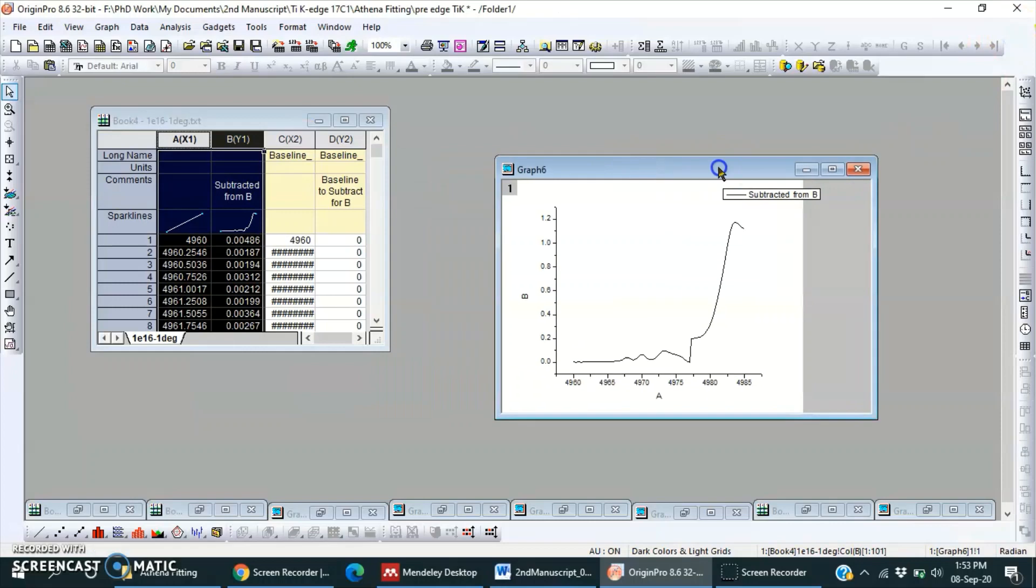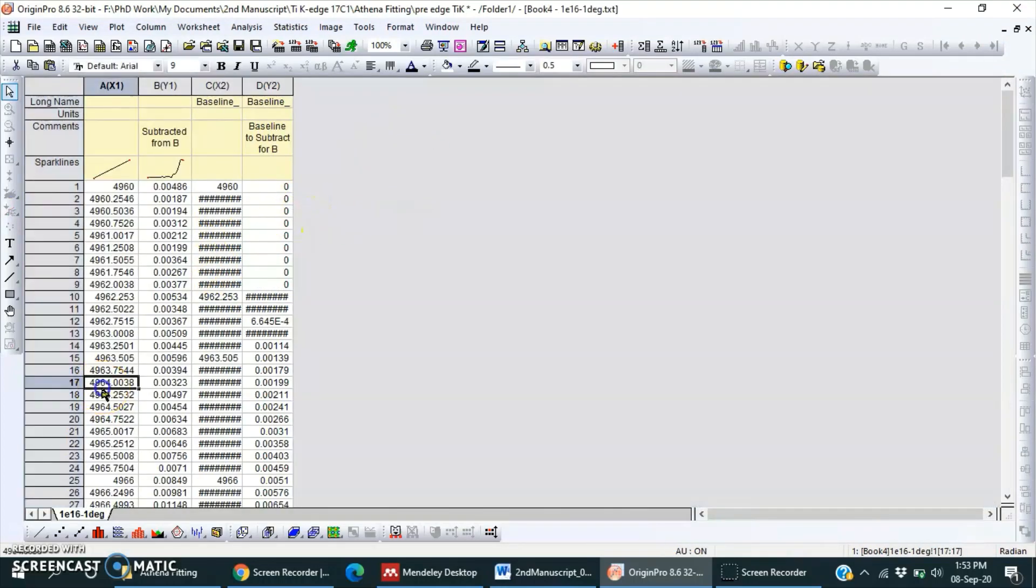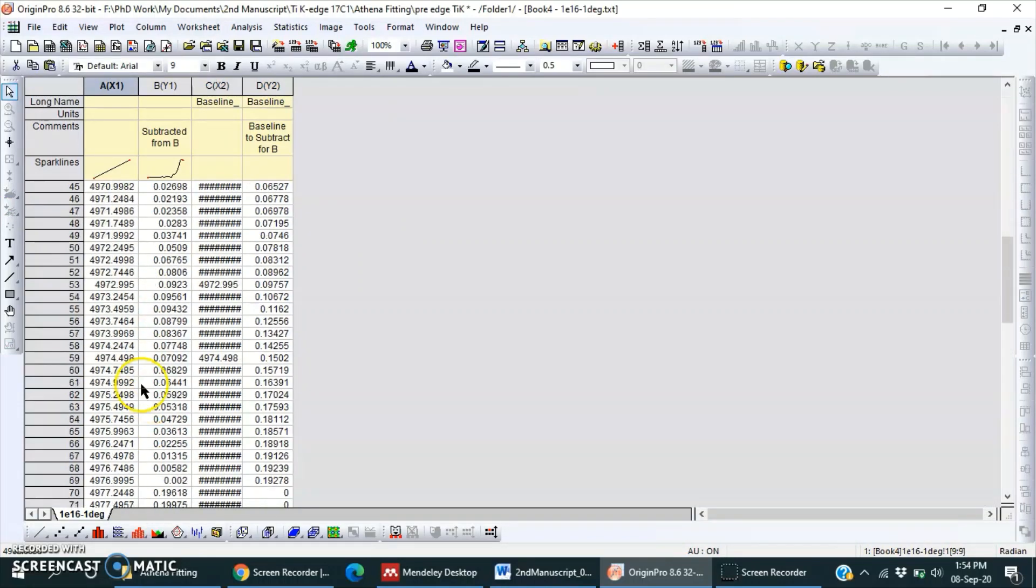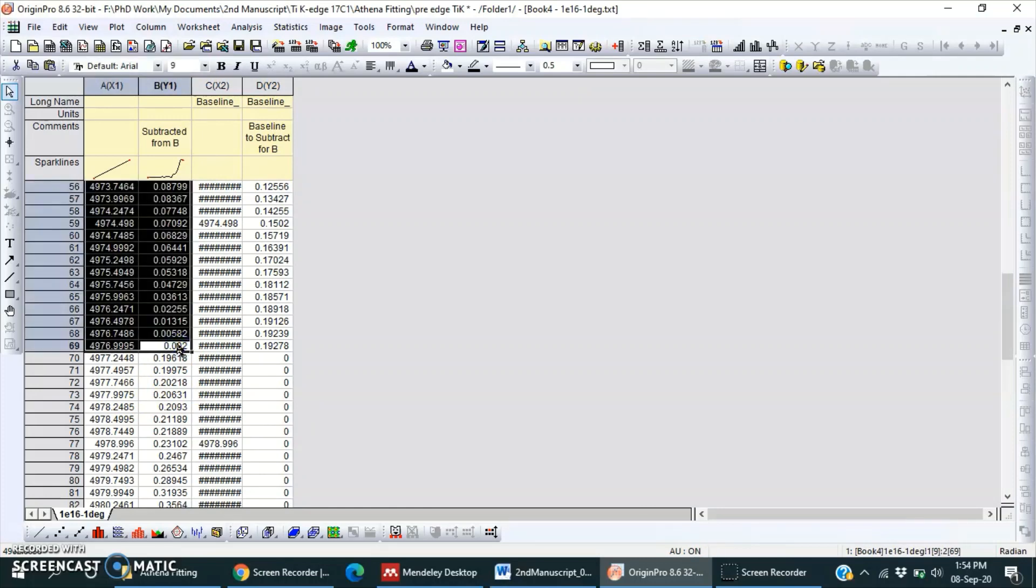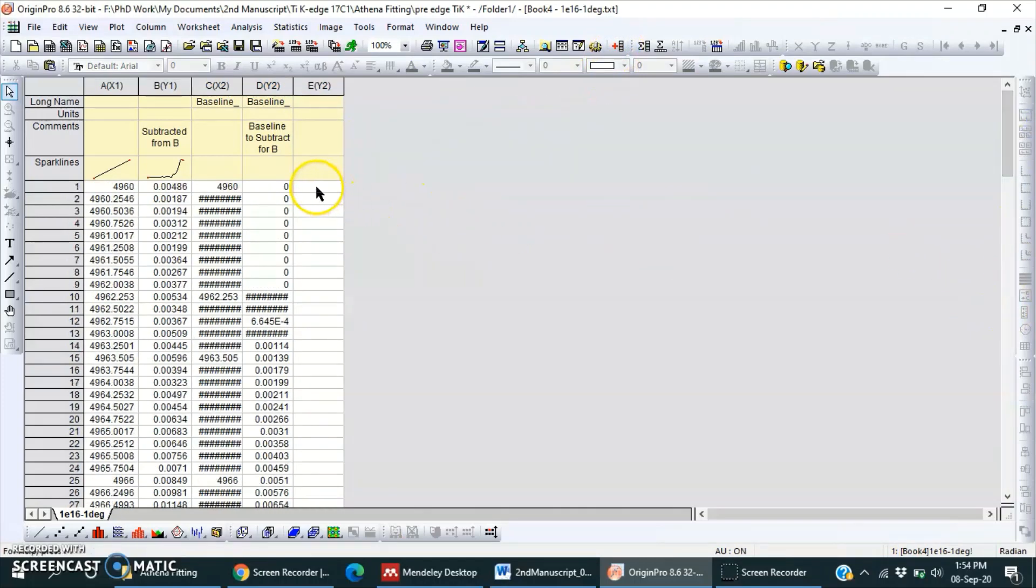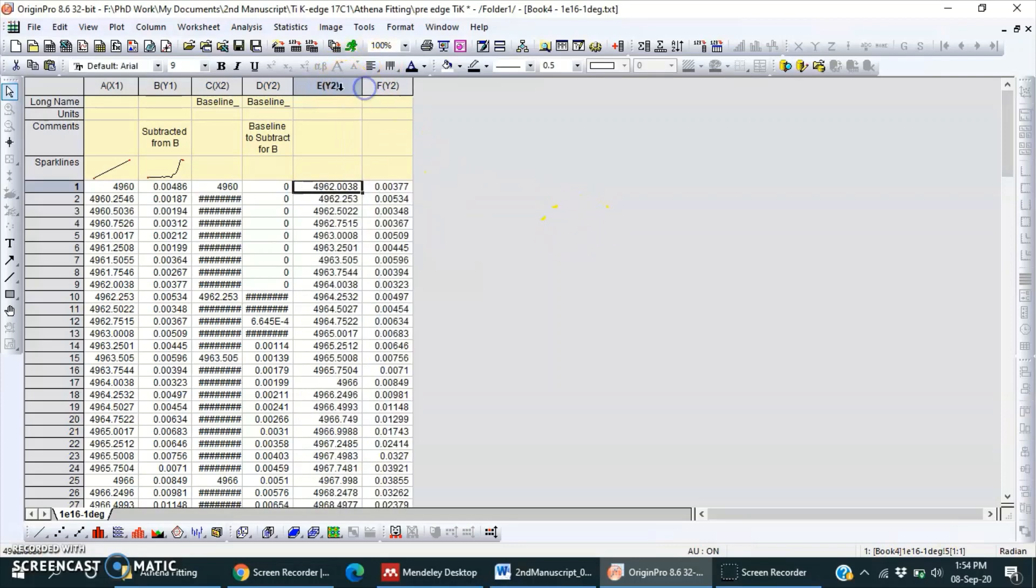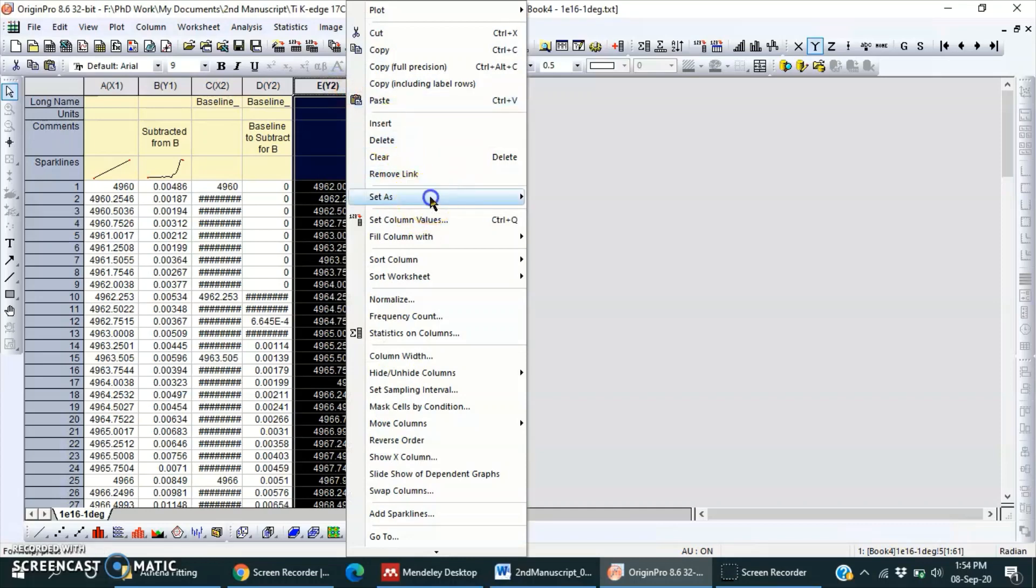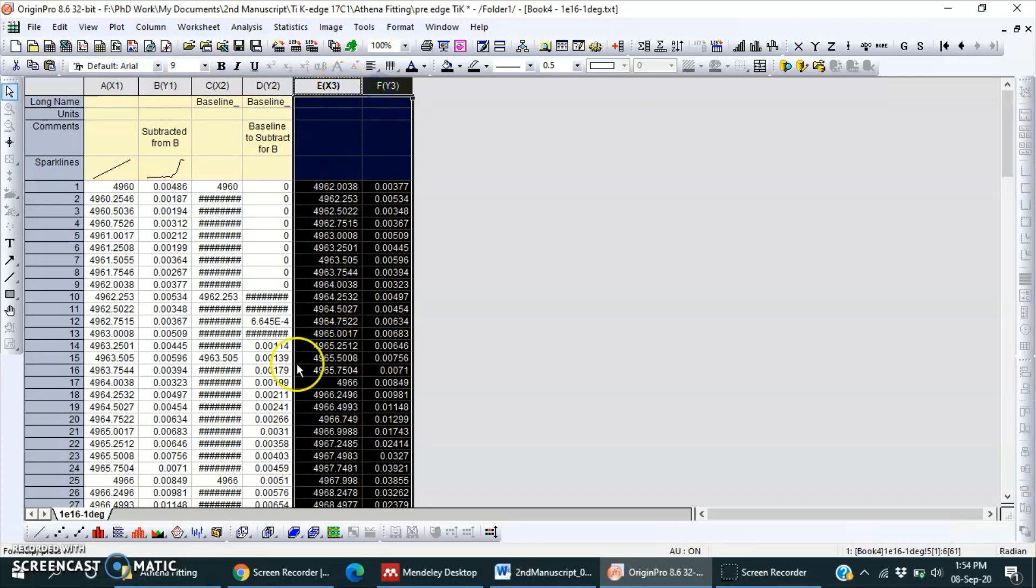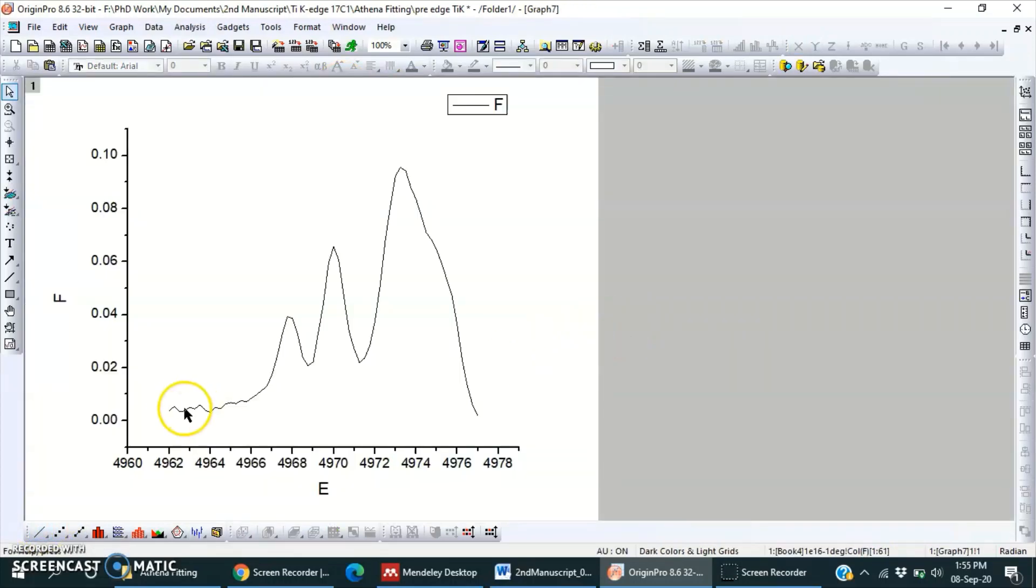Yeah, only this region we have to select and finish this one. Now what we need to do, we will plot from 62 to 77, till here. Press Shift and left click of mouse, Ctrl+C, then paste it here in new column, Ctrl+V. And this column set as new X, so this is X and Y. Okay, so plot this one.